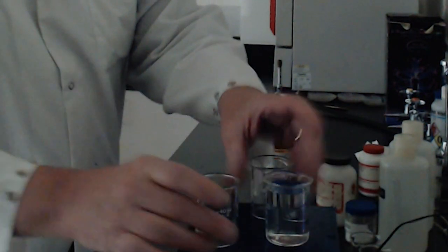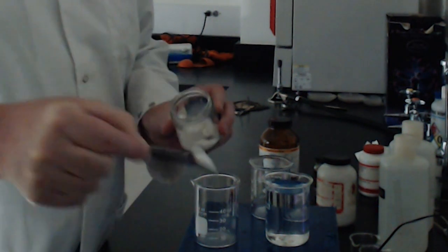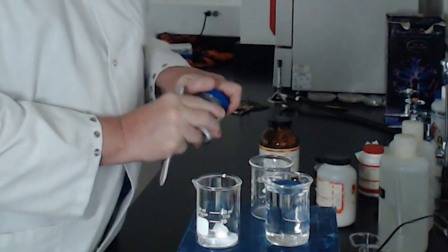Okay, so we have water. What we're going to do is add chemicals to the water. And the two most common chemicals tested are household chemicals, sugar and salt. So I'm going to scoop some sugar into one, and I'll scoop some salt in the other.